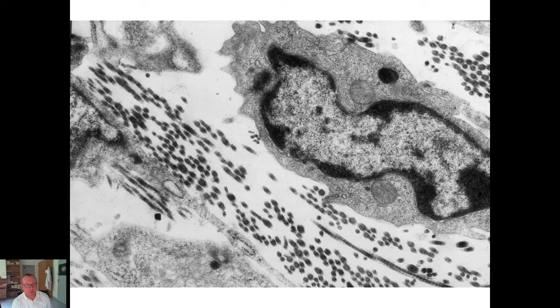You already saw many electron micrographs. So these parts of our specimen which bound the most atoms of heavy metals are black, like this granule, or heterochromatin, you know it, or collagen fibrils, which you don't know at this moment, but you will know them early.